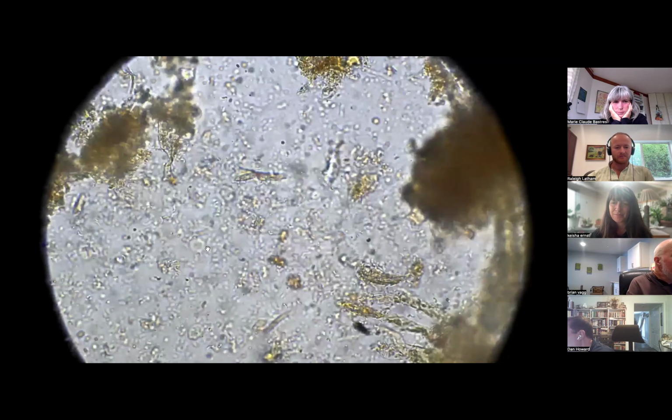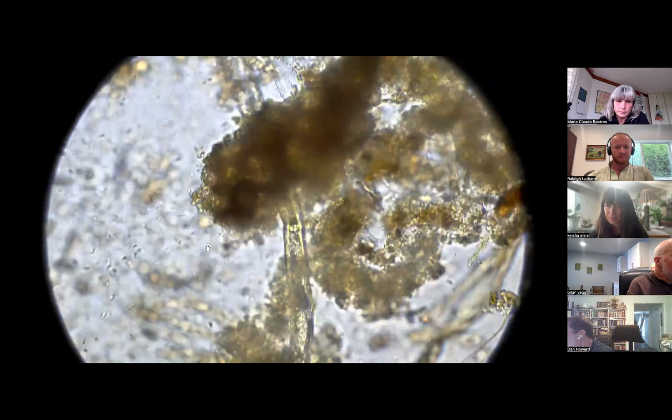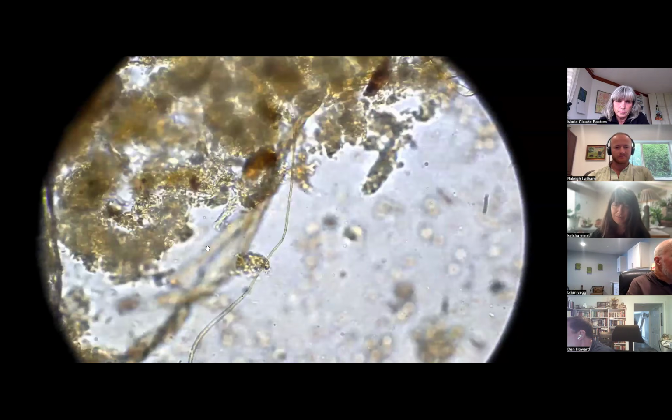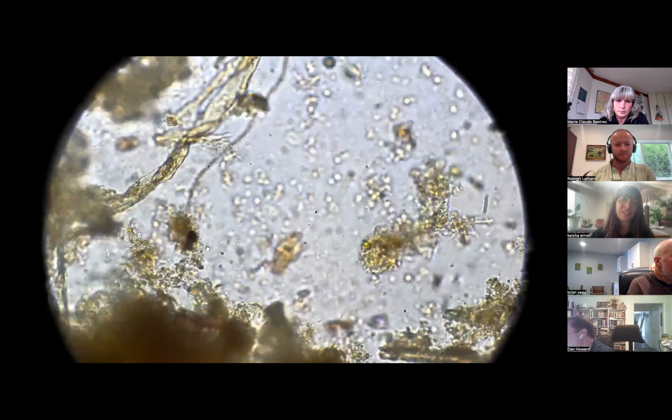Well, I'm glad I was able to show this, and thanks, Keisha, for bringing that up, of having me take a look at this sample, because that does provide you some differences there. And then you can also see that even in that anaerobic environment, the aerobes are persisting.